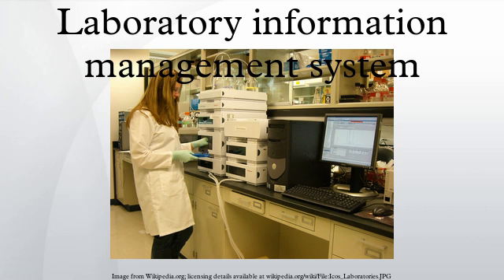LIMS users may also have regulatory concerns to comply with, such as CLIA, HIPAA, GLP, and FDA specifications, affecting certain aspects of sample management in an LIMS solution. One key to compliance with many of these standards is audit logging of all changes to LIMS data, and in some cases a full electronic signature system is required for rigorous tracking of field-level changes to LIMS data.